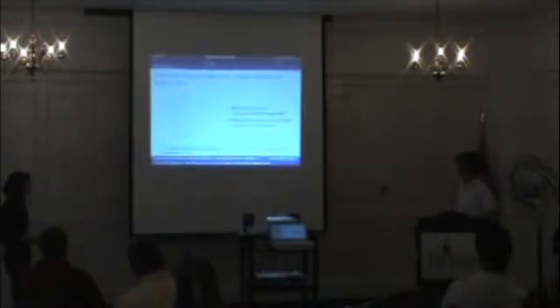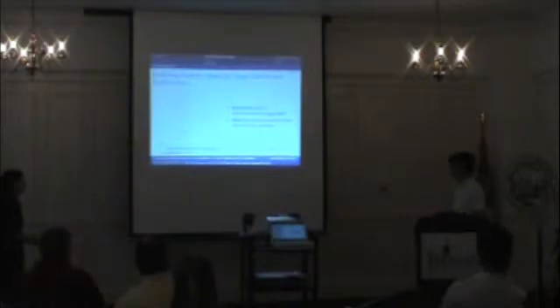segment a shellless embryo, which would accomplish the goal of allowing us to visualize where blastomeres would go if they were unconstrained by an eggshell. Therefore, the maximum and sort of ideal volume and surface area could be reached, and we could segment that data and input it into the model, which would hopefully allow us to further validate our model as a biological system.